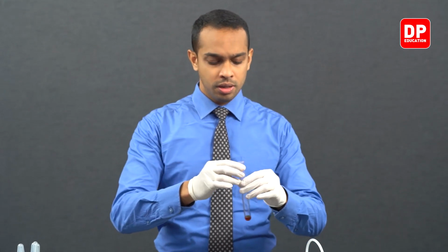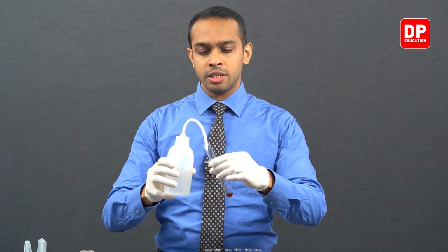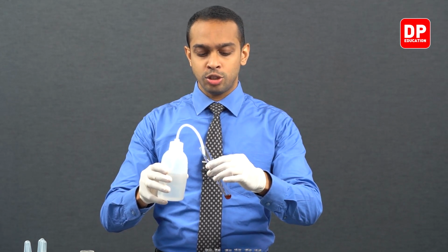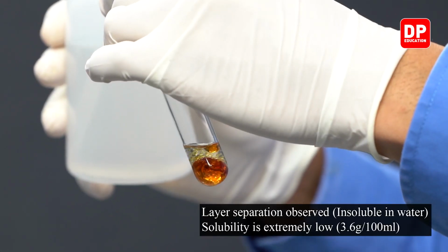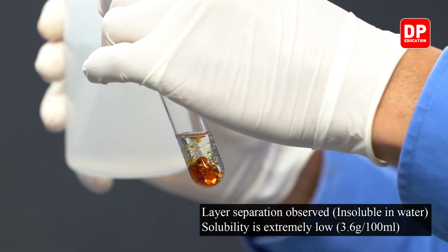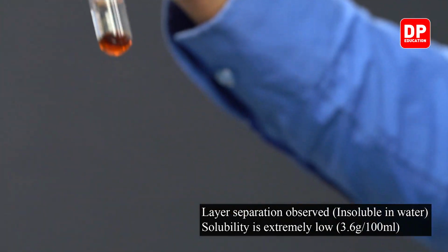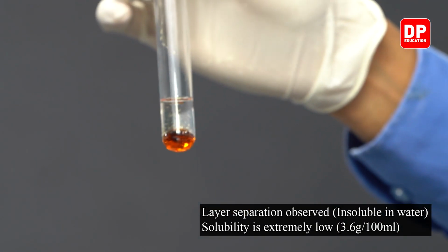Now, let's add a small amount of water to see if it is soluble in water. If it is soluble in water, it will not form two layers. If we can see a layer separation, that means aniline is not soluble in water.